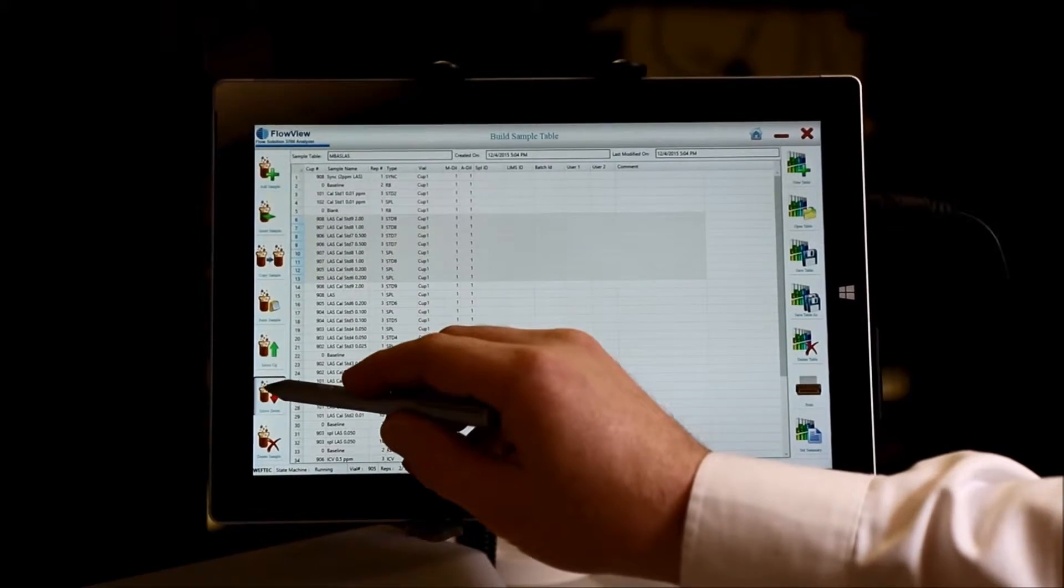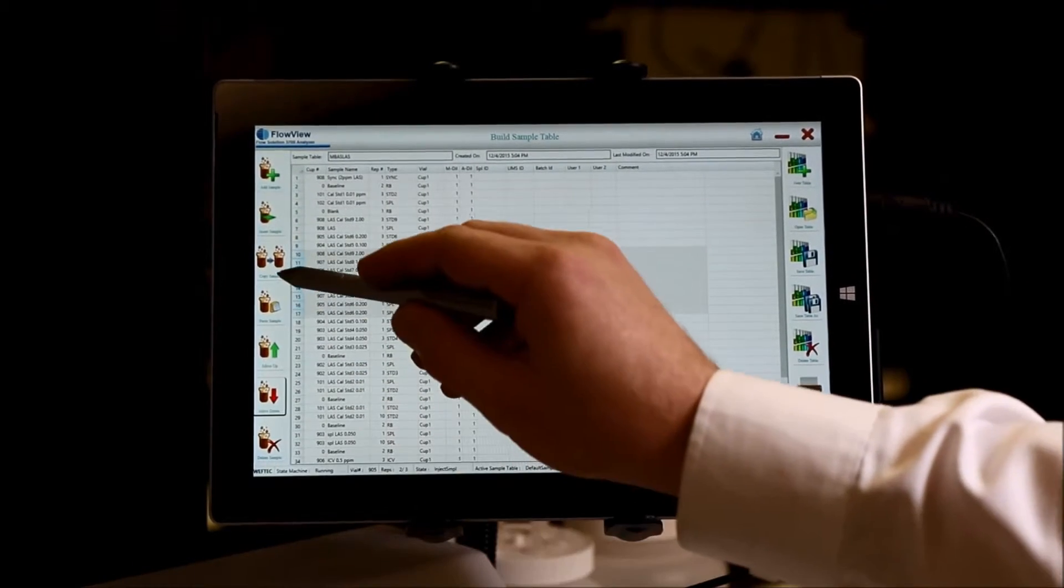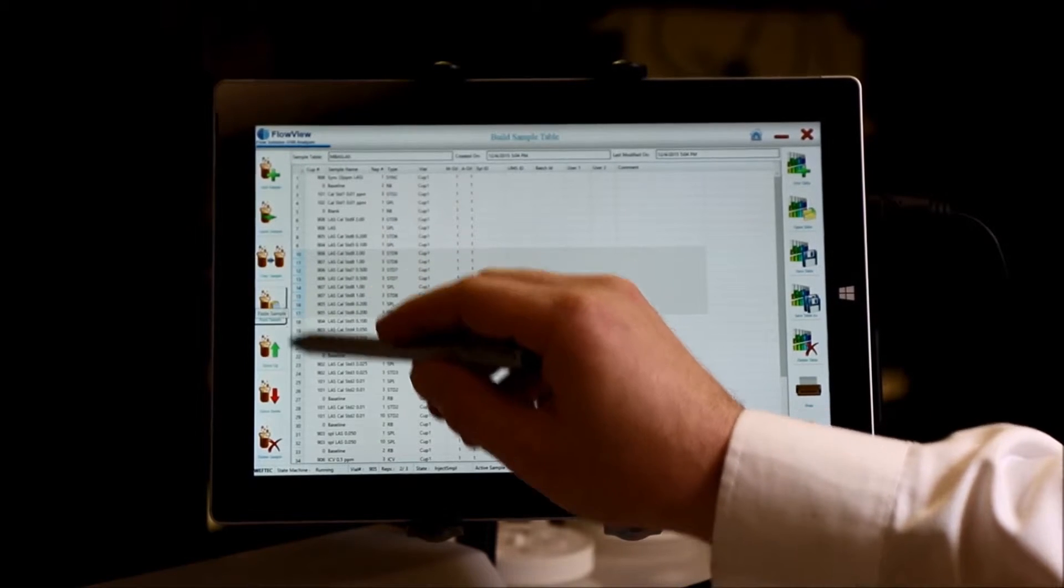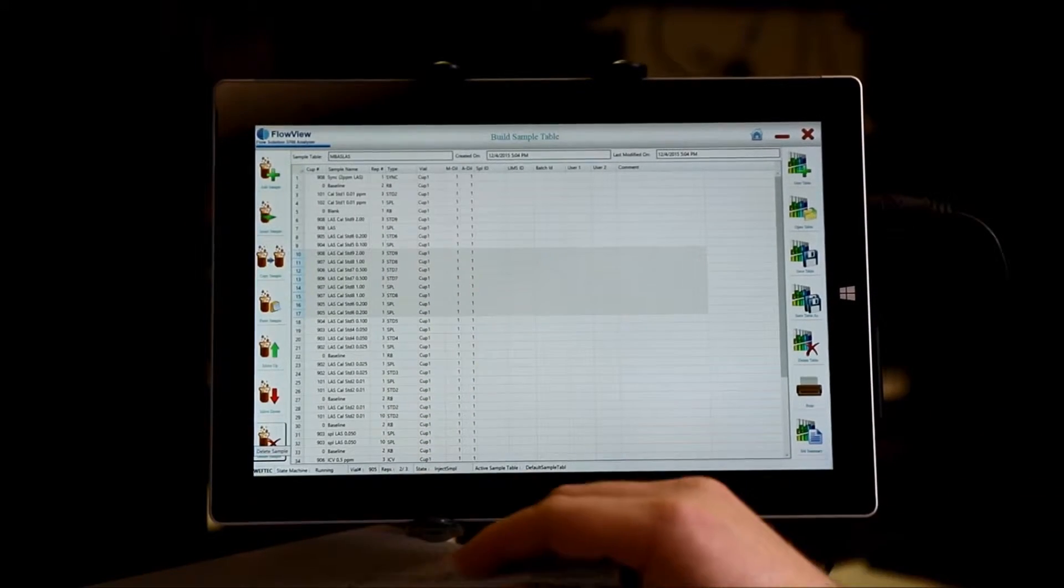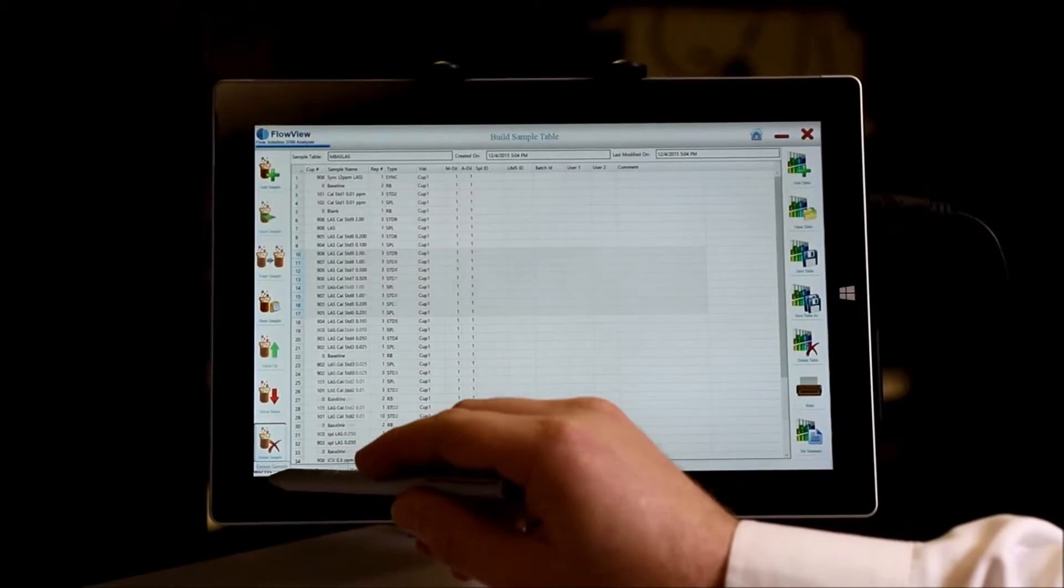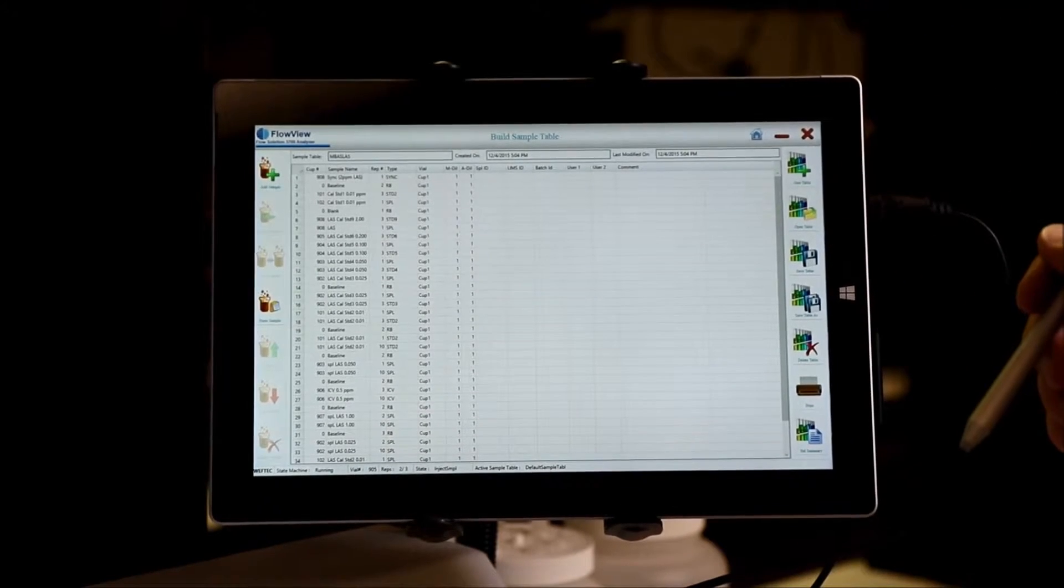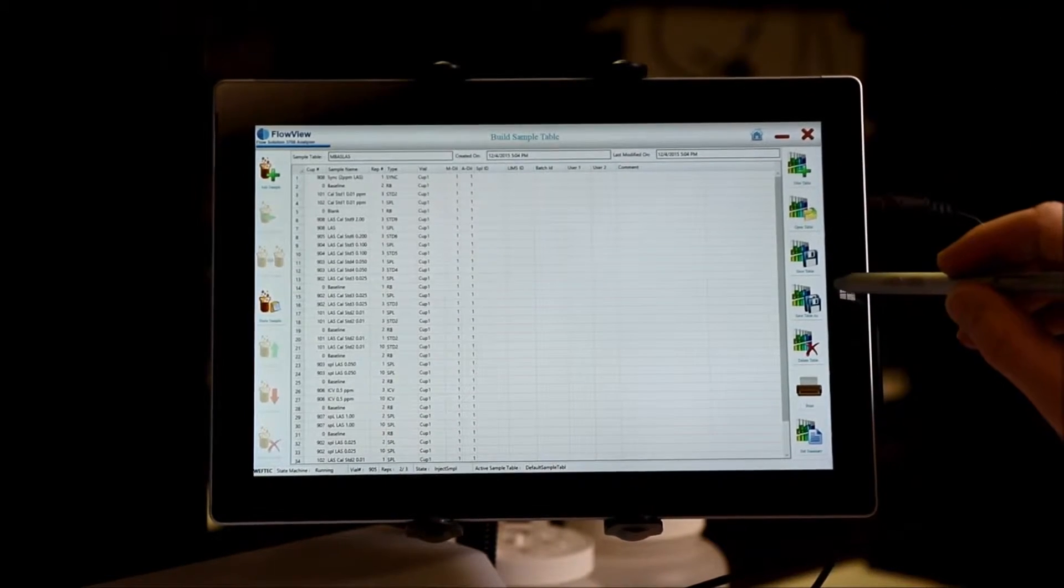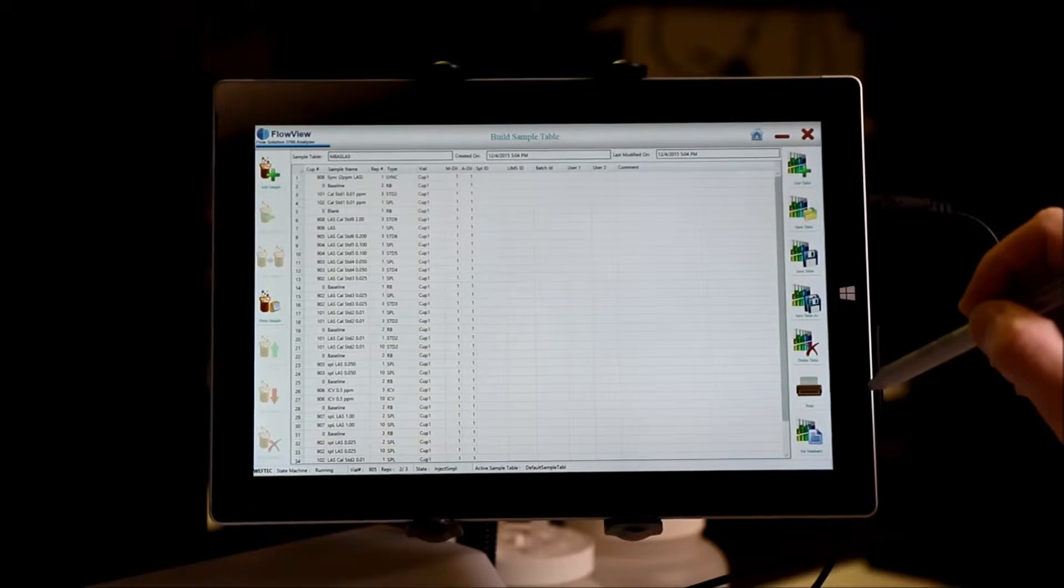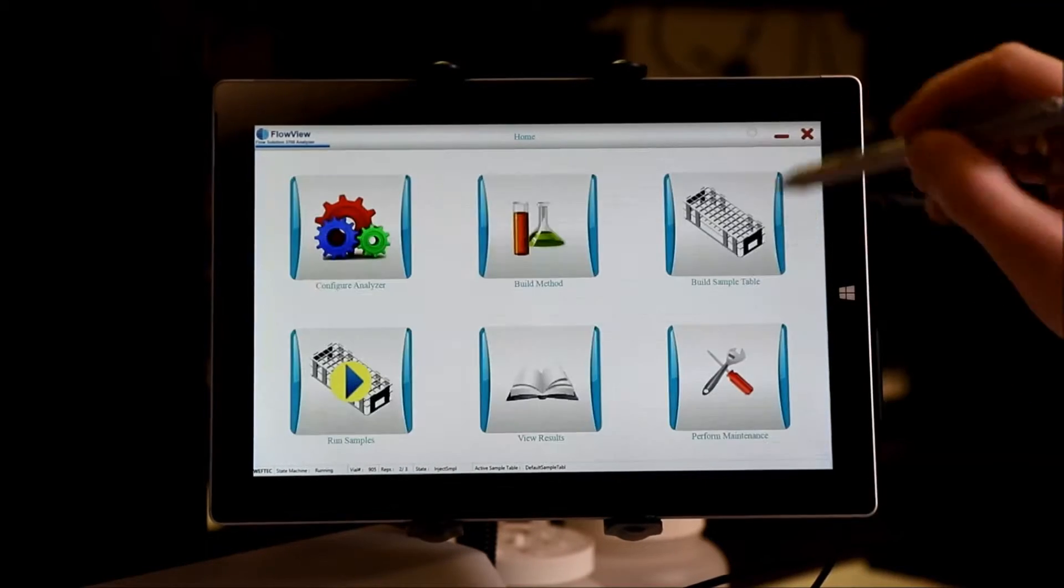They can be copied, pasted, or deleted. Once you're satisfied with your sample table, click save and return to the main screen.